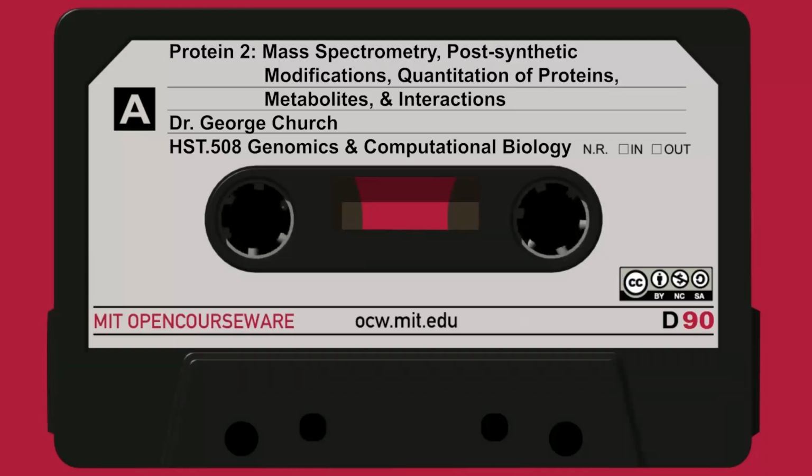The B ions are mixed in with the Y ions, and some of the ions are missing. Each ion has multiple isotopic forms. That wasn't so evident in the previous slide, but in that blow-up that I showed a while back, you had that binomial distribution. There is the lingering presence of A, C, X, and Z type ions, where you've got cleavage of some of the other bonds. Ions can lose a water or an ammonia. You've got noise from other peptides and from contaminants in the system. And you've got amino acid modifications, which is not a contaminant or a bad thing. It's a good thing. This is what you're looking for. But these can be in trace amounts in this sort of system. Okay.